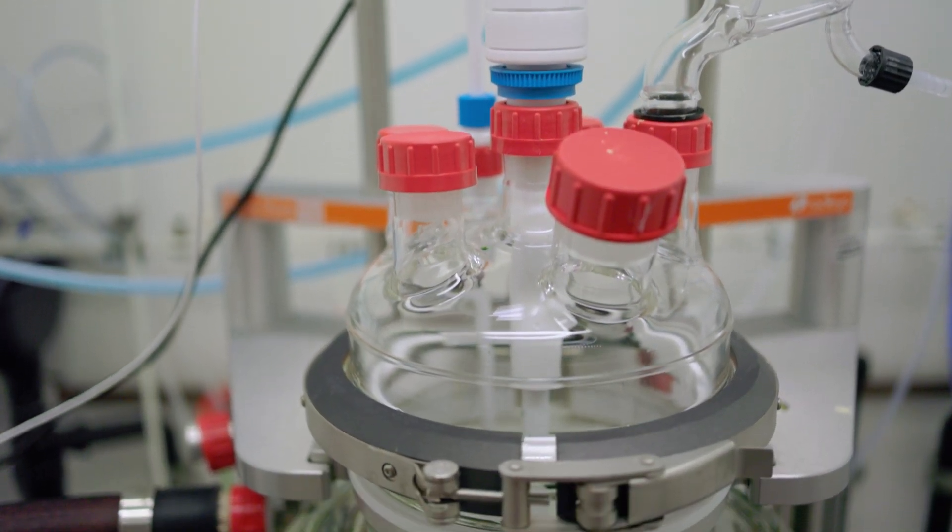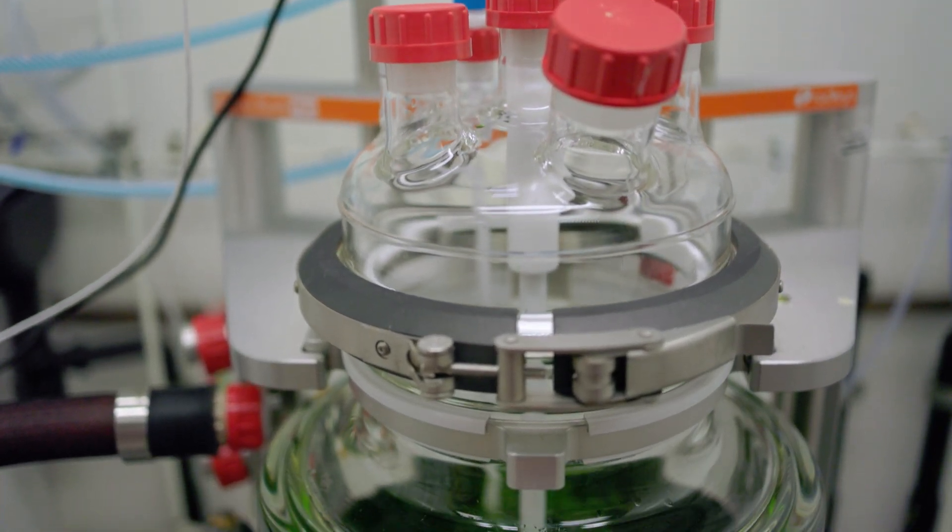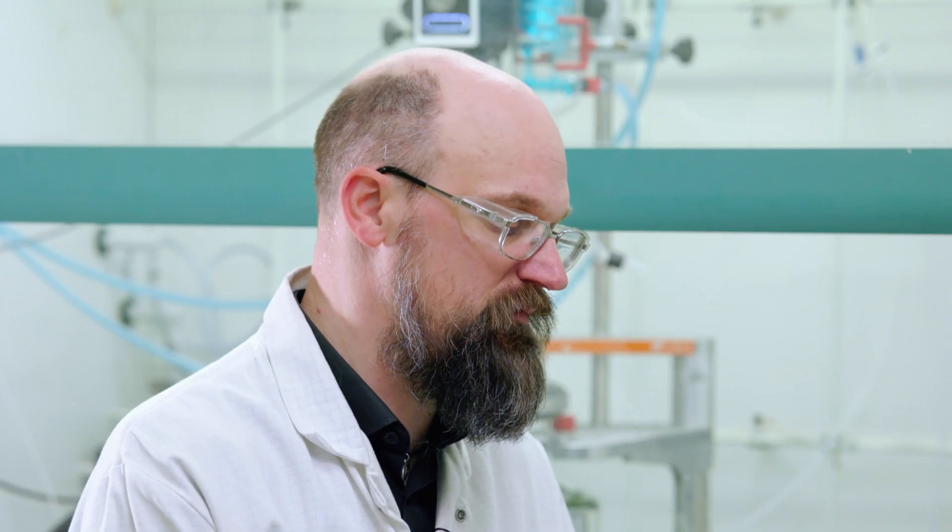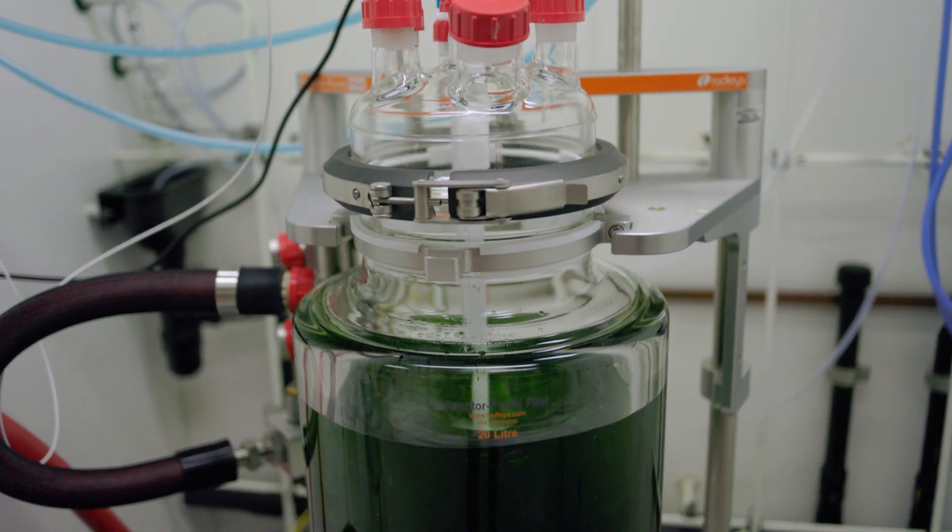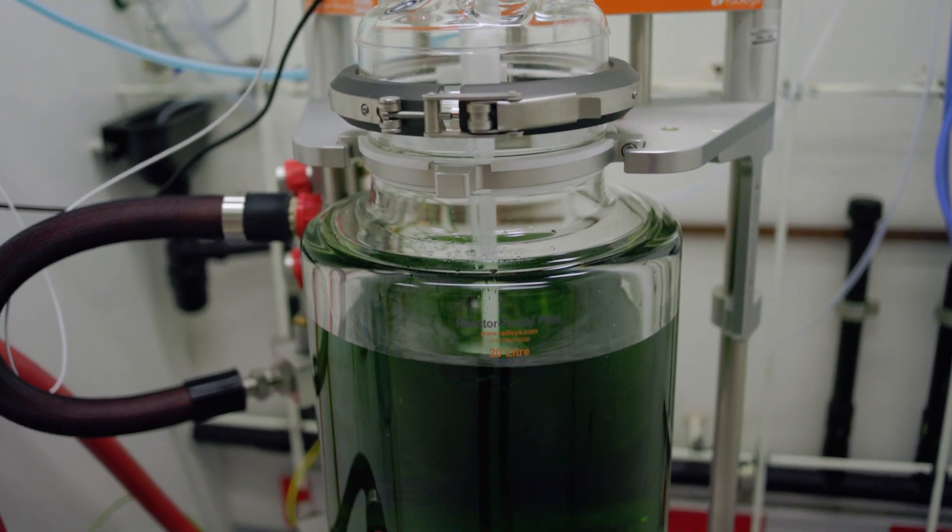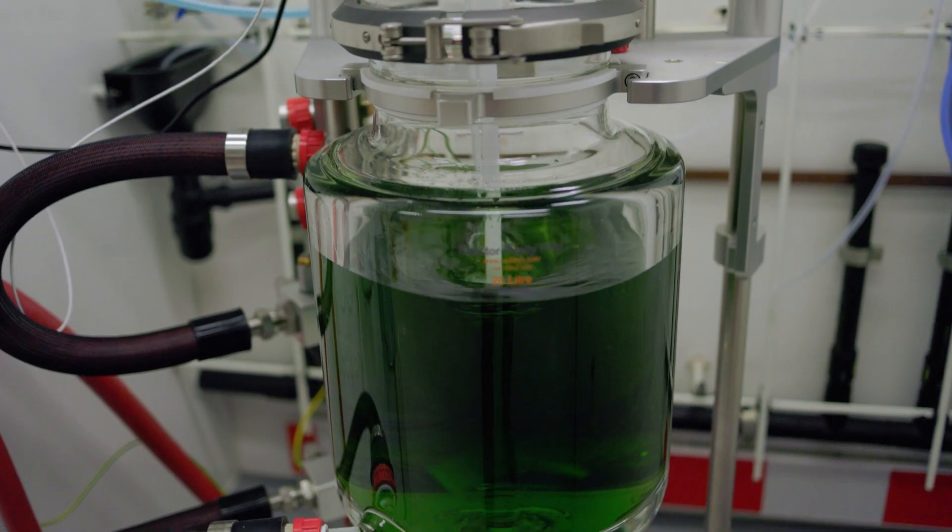We can program experiments outside of the lab and then bring it in, and we don't have to go into the fume cupboards to mess about with the manual controls, which is fantastic. It's very good as well for being able to transfer the pre-programmed experiment profiles from one machine to another, so that we can have that consistency from one reactor to another.